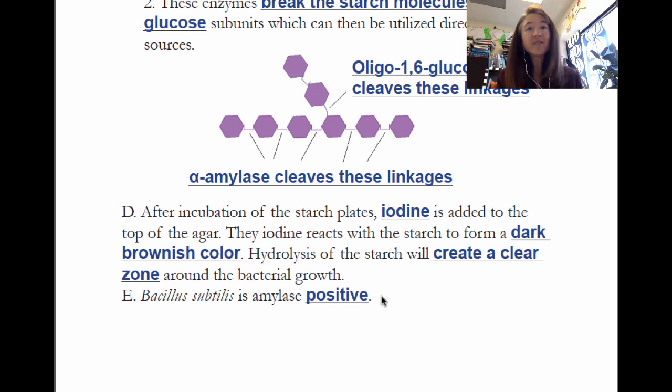So these gram-positive rods, the ability to break down macromolecules by secreting enzymes into the space exterior to the cell is very important in helping us to identify and differentiate amongst them.